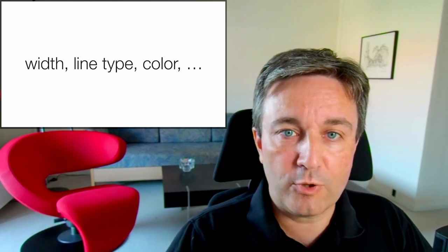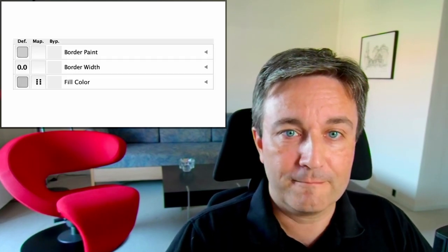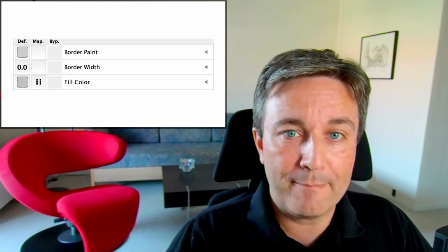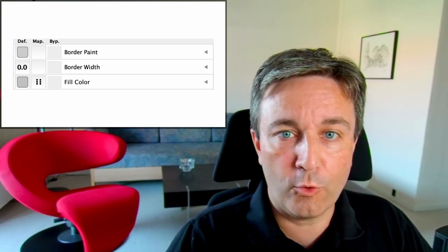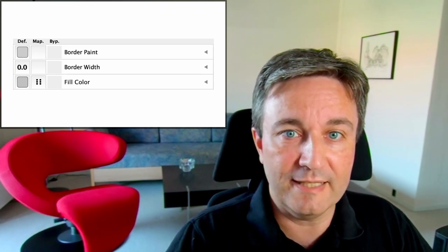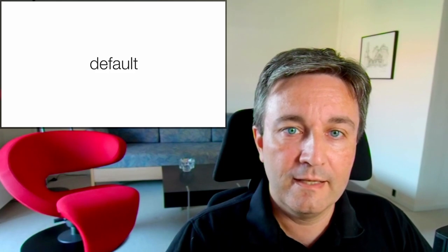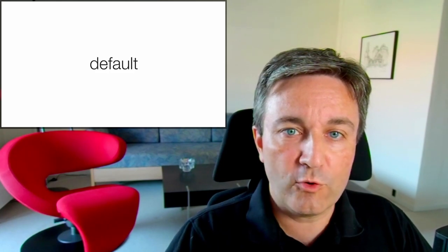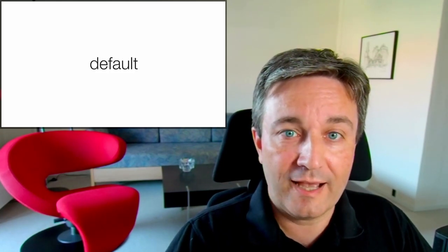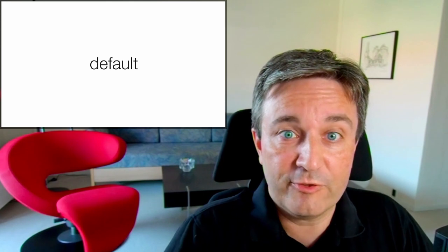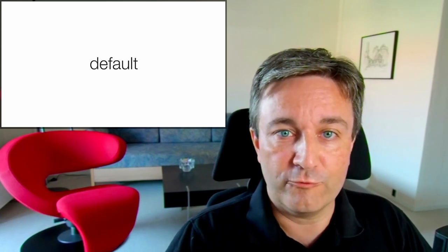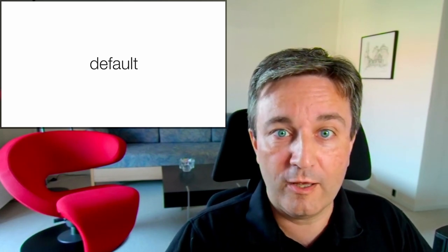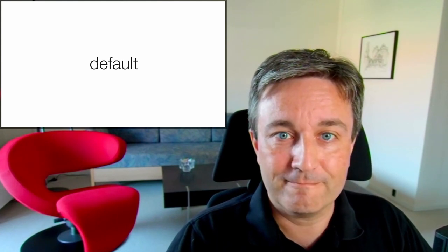For each of these properties, you have a triplet called default, mapping and bypass. This is a core concept of Cytoscape that you really need to understand. The default value for each specifies how this is going to be if there's no other information. For example, the default color would be the color that is used when you have missing values.